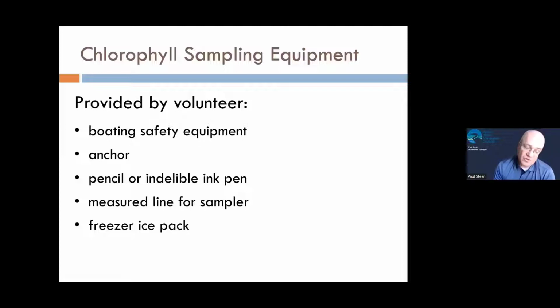So to do that, you will want to maybe just grab your Secchi disc tape measure and put them side by side next to each other and mark every 5 feet, every 10 feet, and then maybe every 2.5 feet in between those marks, so that you have a nice rope line that has proper depth measurements across it. And that's what you'll use and attach to your integrated sampler.